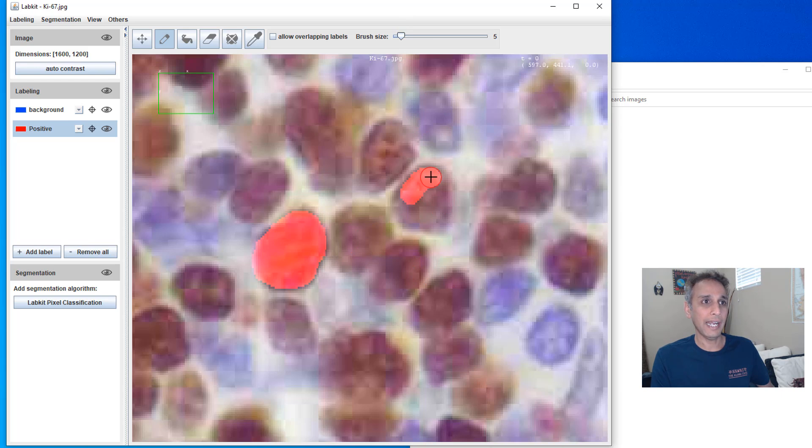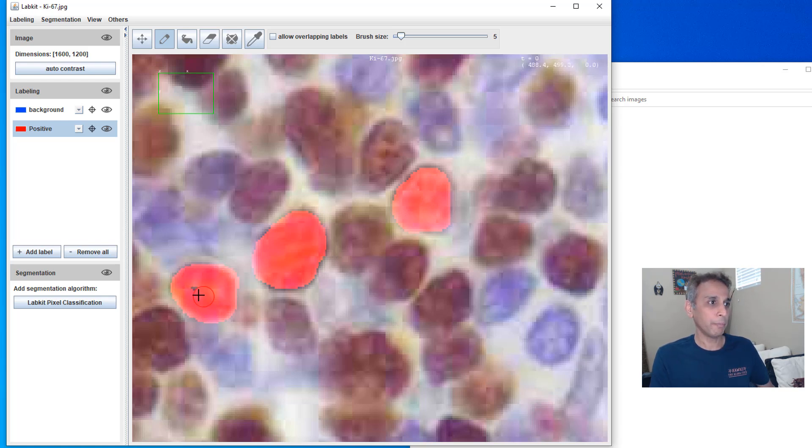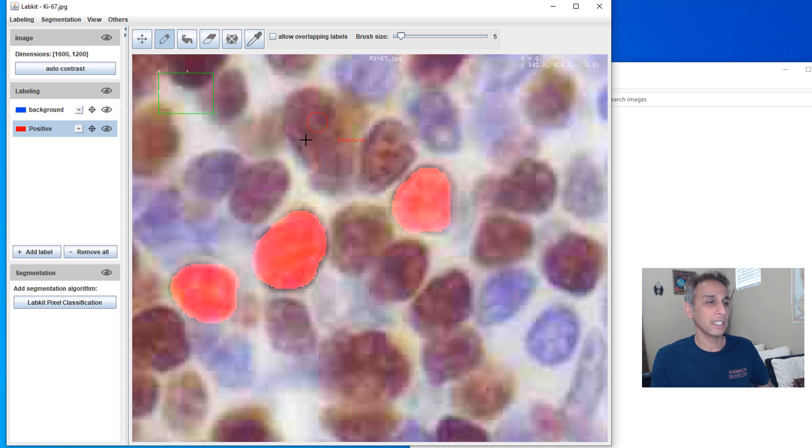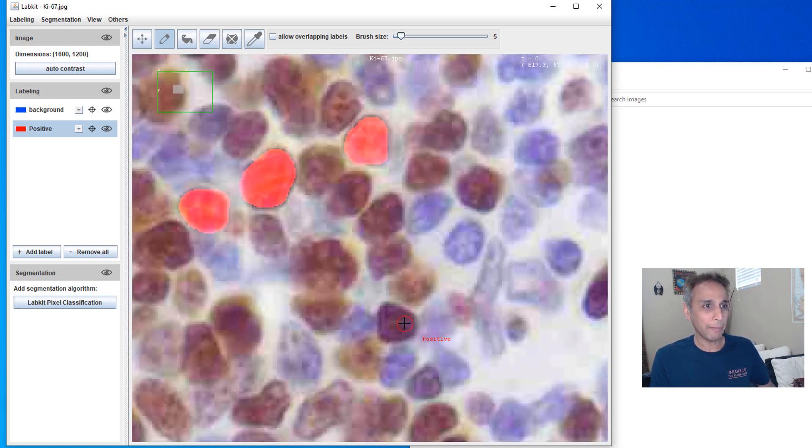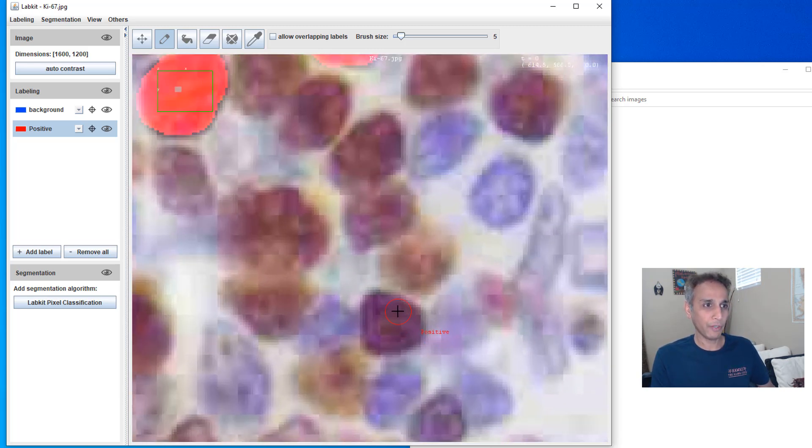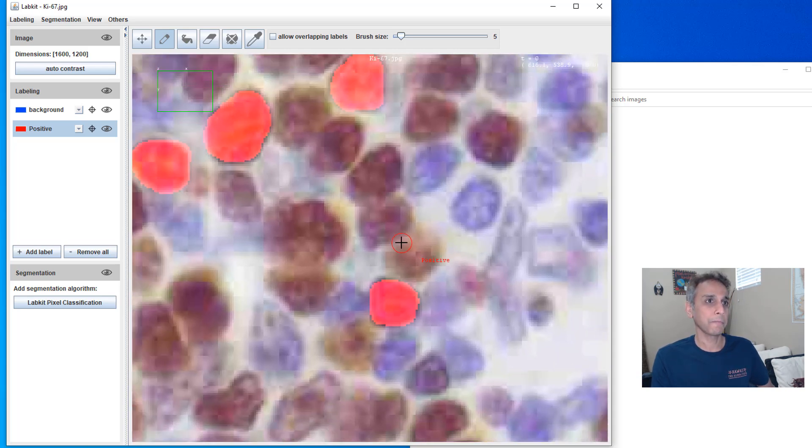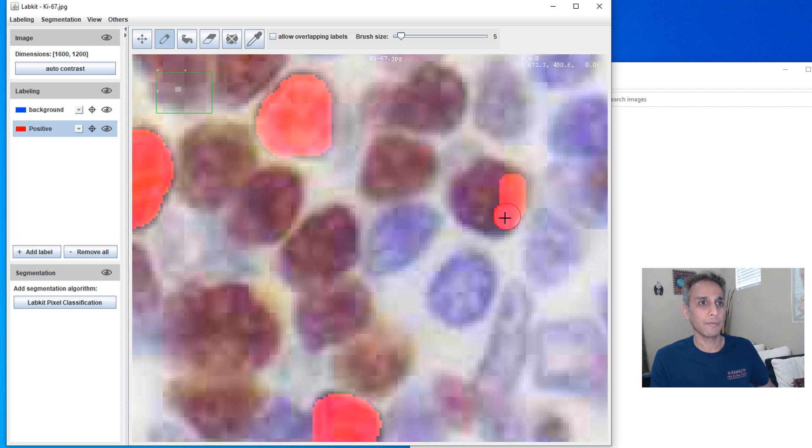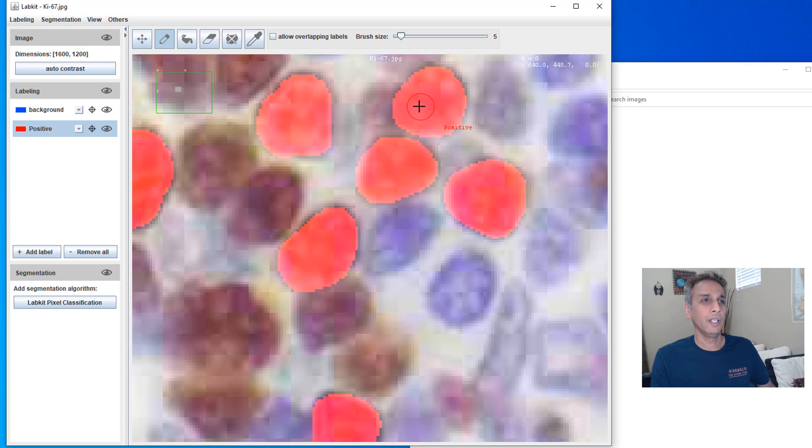You can change the colors and all that cool stuff as usual and go ahead and paint these. If you want, you can increase this to a little bit. Okay, seven pixels, that's too big. Let's go back to five. Okay, let's add a couple more annotations for our brown pixels.